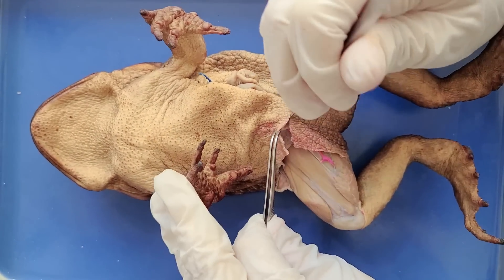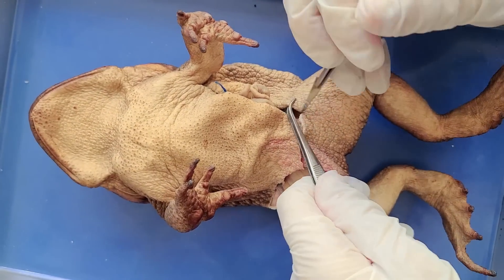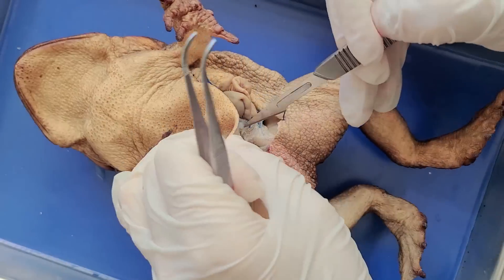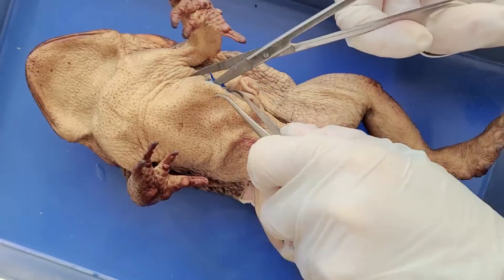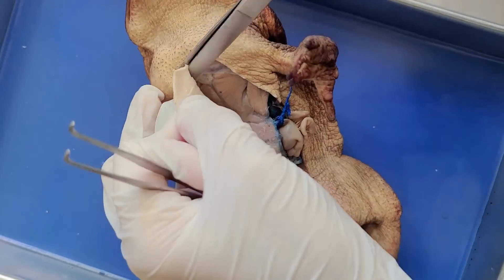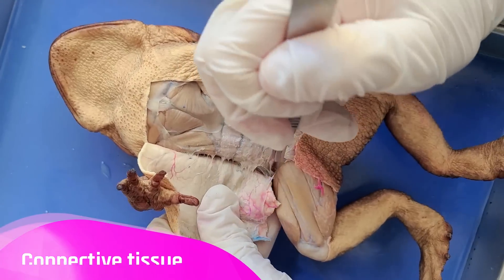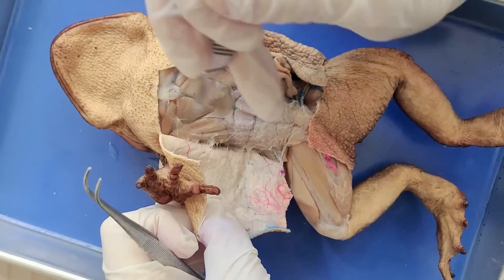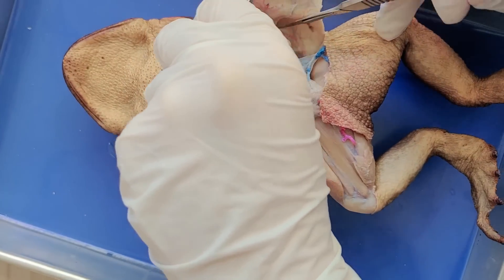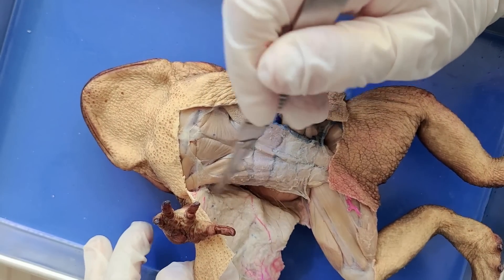Now I'll open up the torso, and to do that I'll cut through the skin here, being careful not to cut through the muscle layer right underneath. Cut horizontally near the legs, then cut vertically up the side, and then cut horizontally again near the arms to make a sort of rectangle. The skin is attached to the muscle by connective tissue, which is the silvery material that my scalpel is cutting through. So now I'll just cut this rectangular flap of skin off to make a sort of window.